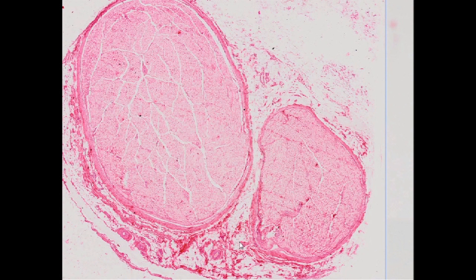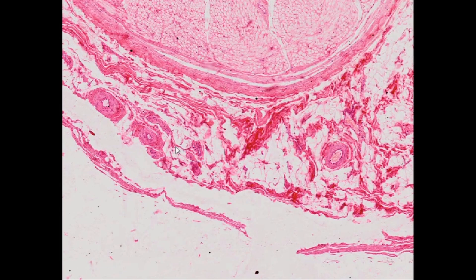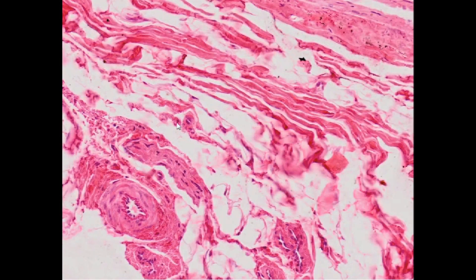The bundles of nerve fibers are fused into the nerve trunk by the epineurium, a layer of connective tissue containing multiple blood vessels that supply the nerve, as well as collagen and elastic fibers and fibroblasts. The nerves of the peripheral nervous system can be identified in a tissue specimen using antibodies against neuron-specific enolase (NSE).